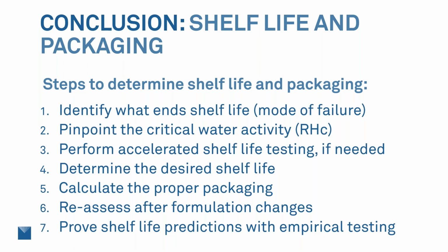Now, if you haven't already done the shelf life testing, you need to make sure that after you've done all your predictions, because they are predictions, they're very handy. The software is really great at just manipulating things very fast and giving you a quick response. If you decide that your storage conditions are changed, you can just change that and recalculate it. But they are indeed predictions off mathematical equations. So you need to get some empirical testing to prove that your shelf life is going to actually fulfill what you want it to fulfill.